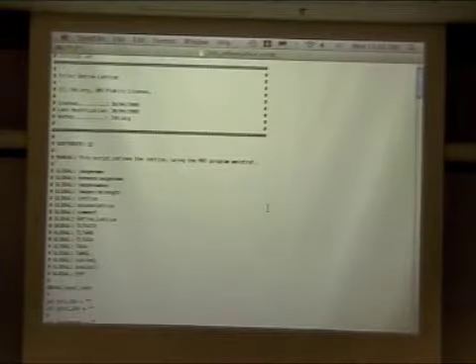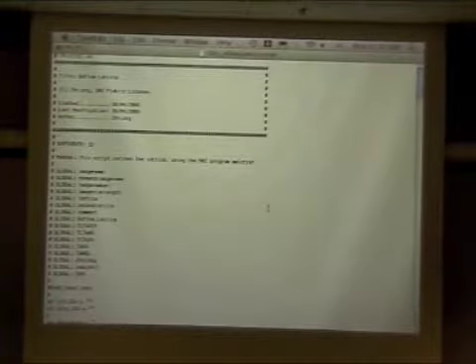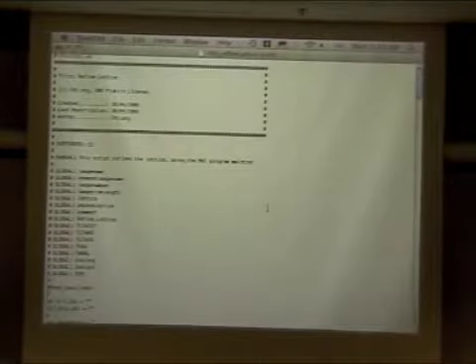And this was so that, our kind of dream about this is that as people start generating these things, if someone wants to take on helical processing, for instance, which we'd very much like to do, and they write a script for it, please upload it, assuming that you want to, and the manual will hopefully help explain things in a way that online documentation might not.